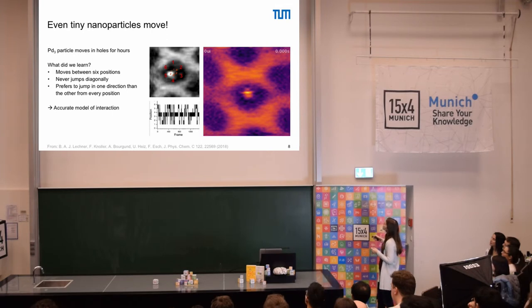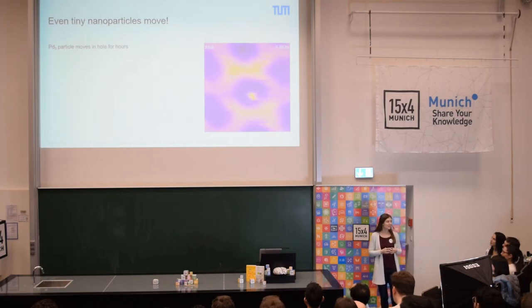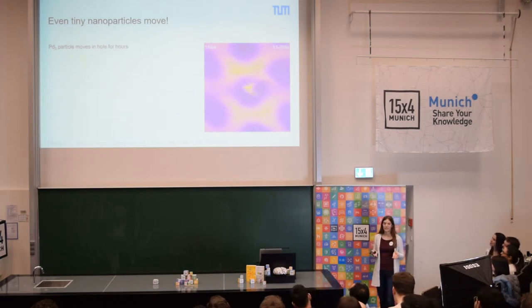So we have this nanoparticle here. And as we watch it, we see that it moves around in this little hole forever and ever. We've been watching it for hours. So this part is moving around. But it's not just a nice moving path. I mean, we learn a lot from watching this.